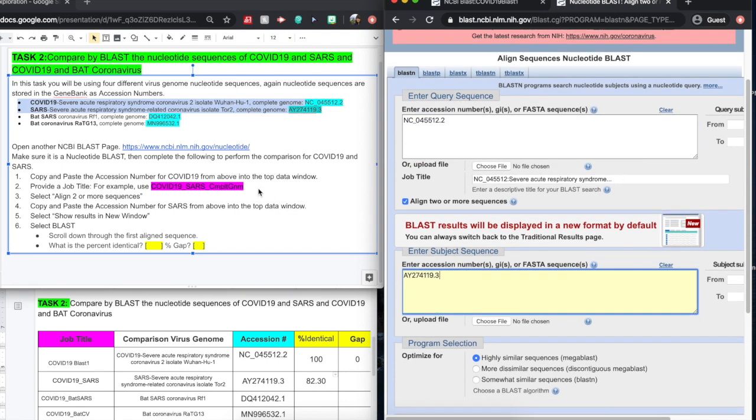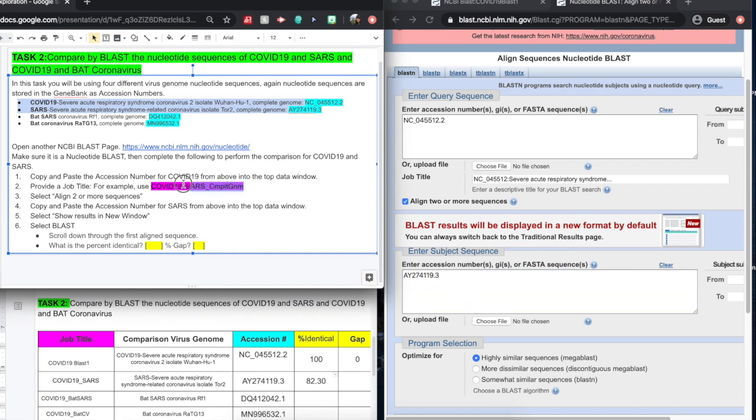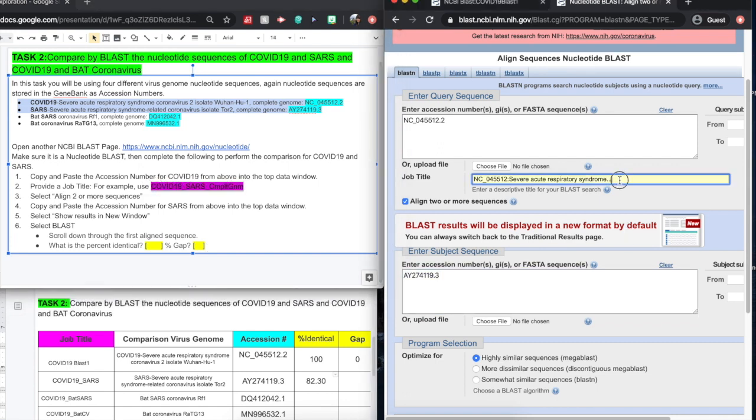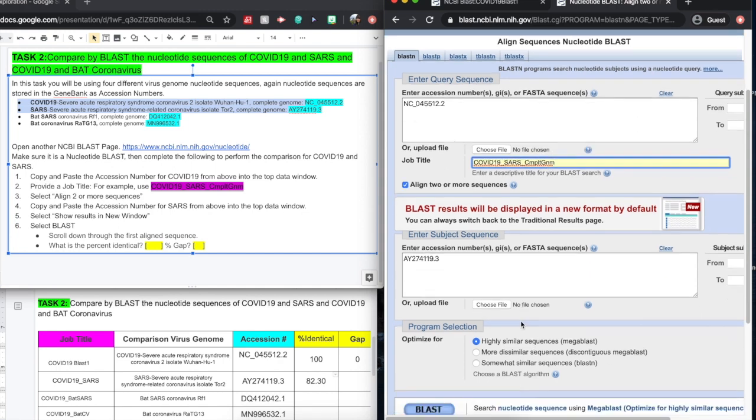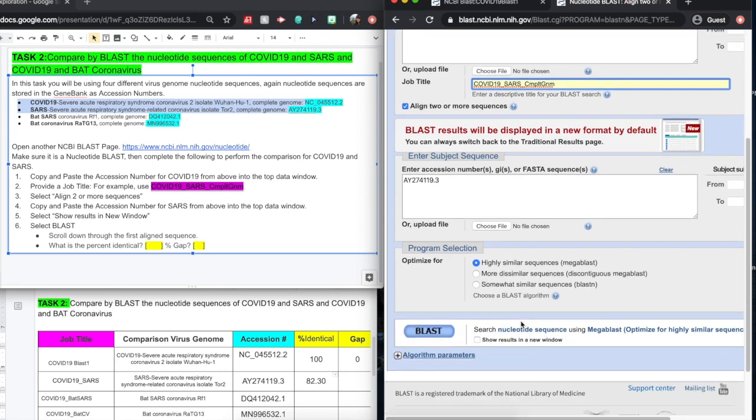It's also important to include our title. So I'm going to copy and paste the title. We're going to see shortly how many tabs are going to open up at the top of our screen here. And just before we're done, we hit BLAST.